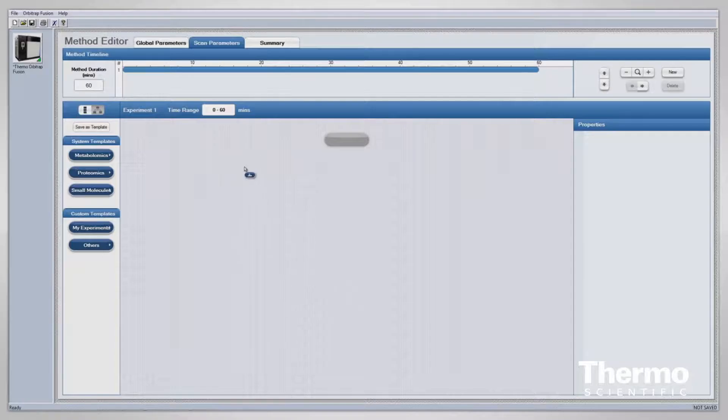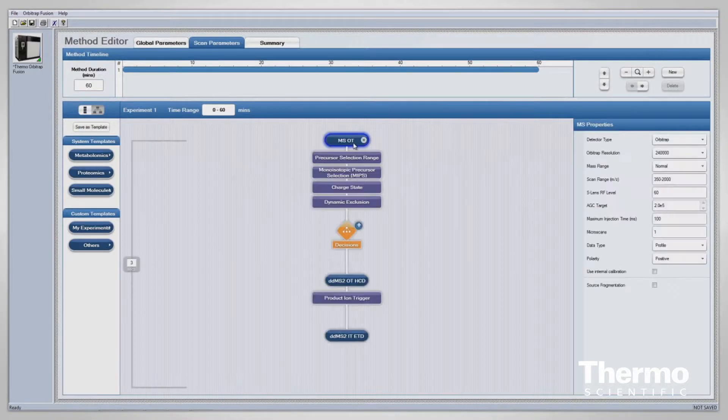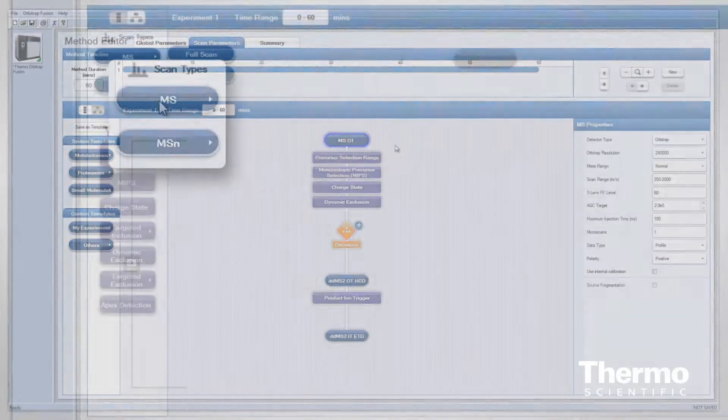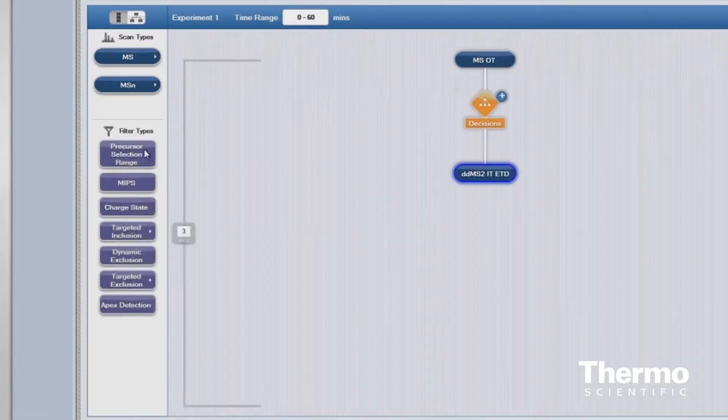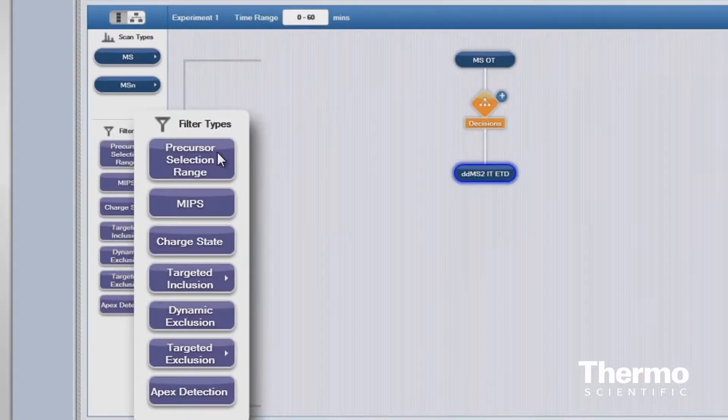As far as the software and connectivity, it has a new method editor entirely, which makes for a much easier construction of methods with a drag and drop interface where you can assemble your method from scan types and scan filters. We have a very simple internal calibration — essentially a mouse click internal calibration — where we use our new ETD source. It's a very simple method editor, so we just simply turn it on with a mouse click.